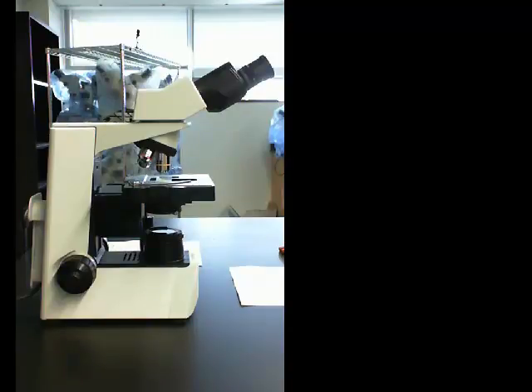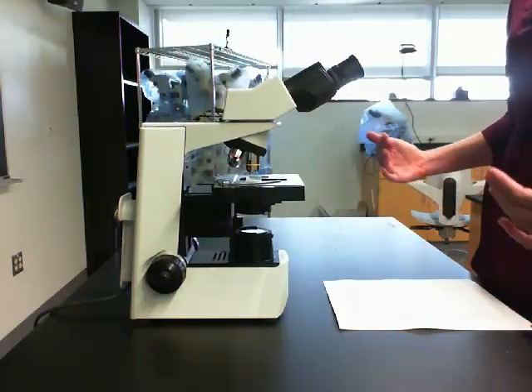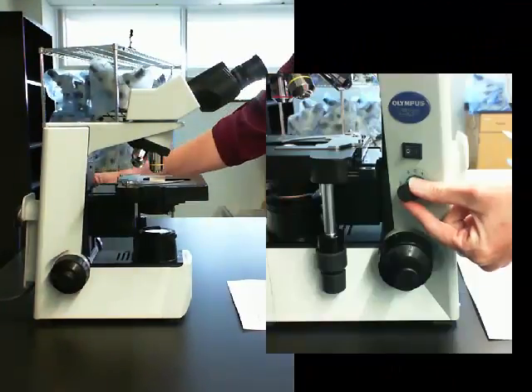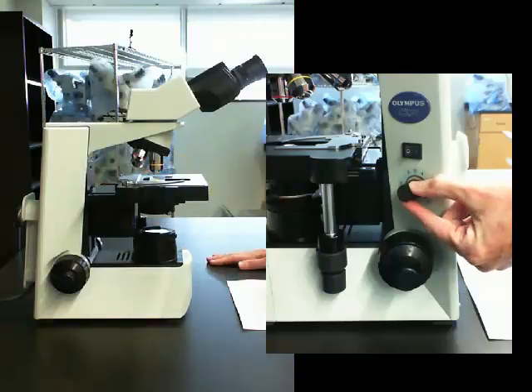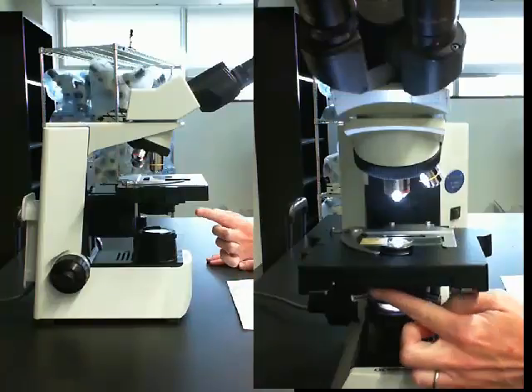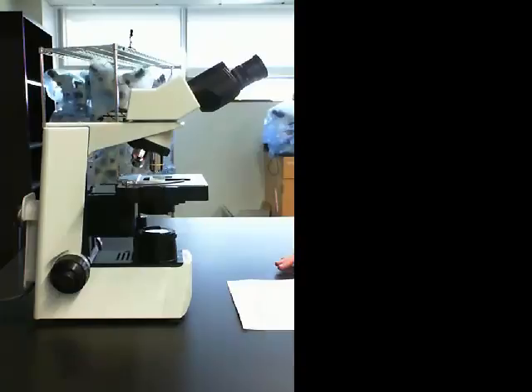Again, pay attention to how close the objective lens is to the slide. So as you switch between objectives, you should always be looking at the slide and the objective as you make that change. Once you have your image in focus, you can continue to fine-tune your view of your specimen. You can control the intensity of the light, you can move the substage condenser, and you can control the iris diaphragm. I'll talk more about those three in just a moment, but it's really important that you make those adjustments to get the best view of your specimen possible.